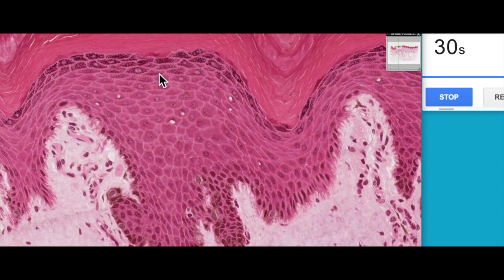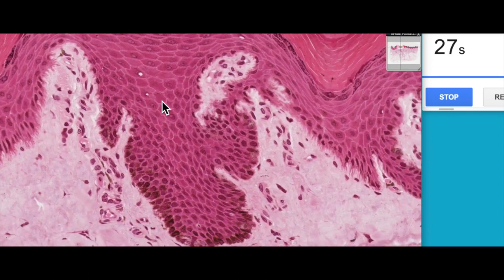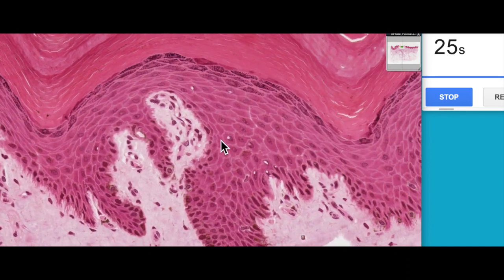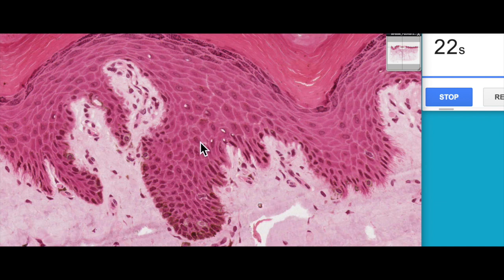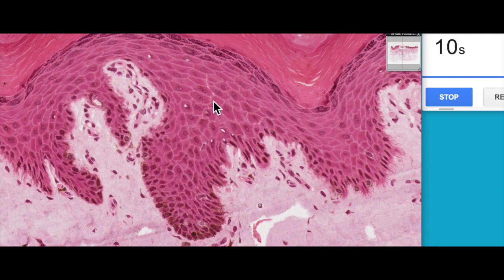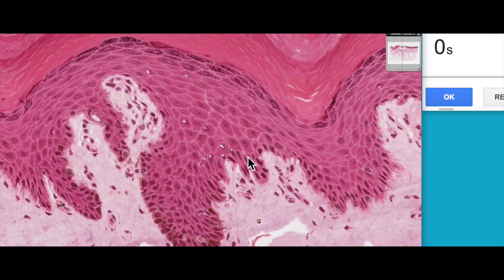If we zoom out into the stratum spinosum, sometimes we might be able to see the third non-keratinocyte found within the epidermis — the Langerhans cell. Langerhans cells are dendritic cells and part of the innate immune system. They have long cytoplasmic processes that form networks and can phagocytose any invading microorganism. They can then leave the skin and act as antigen-presenting cells in the immune system.